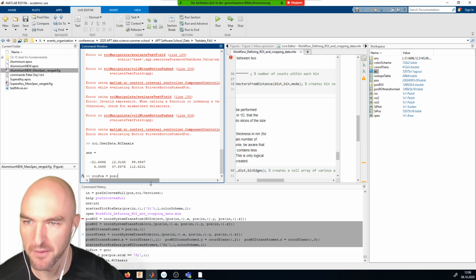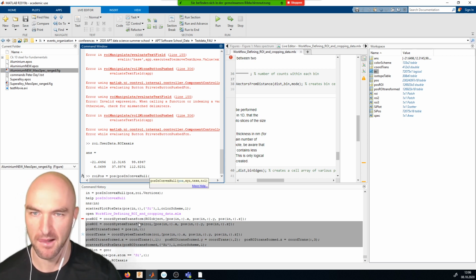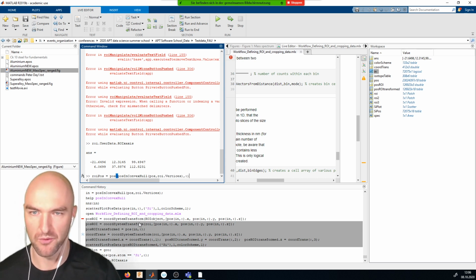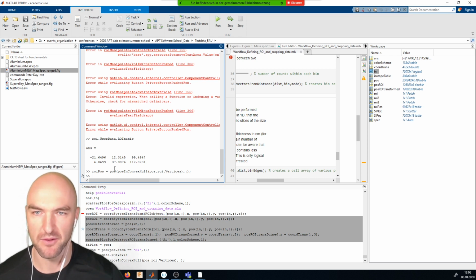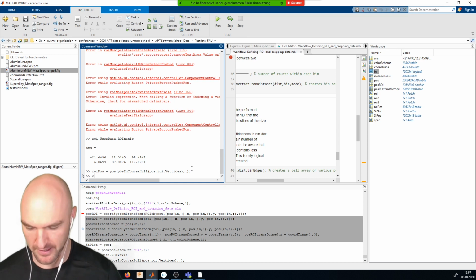and now I need to remember what the pos in convex hull of our pos variable, and the XYZ is again our ROI.vertices. And we want all of the entries that are in there. And now it obviously calculates for a second or so, and then we have our ROI pos with about 100,000 atoms in it.